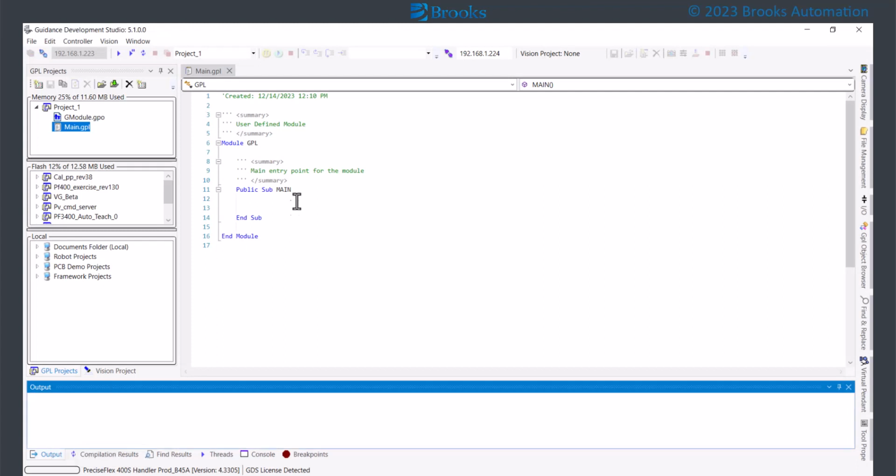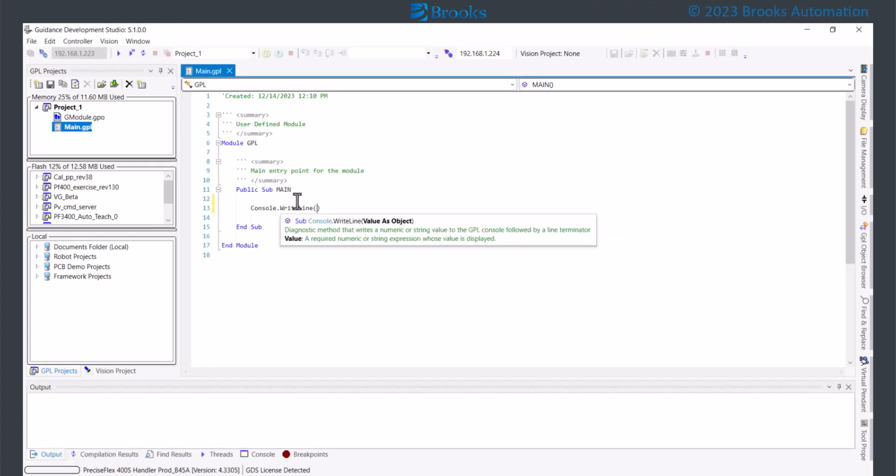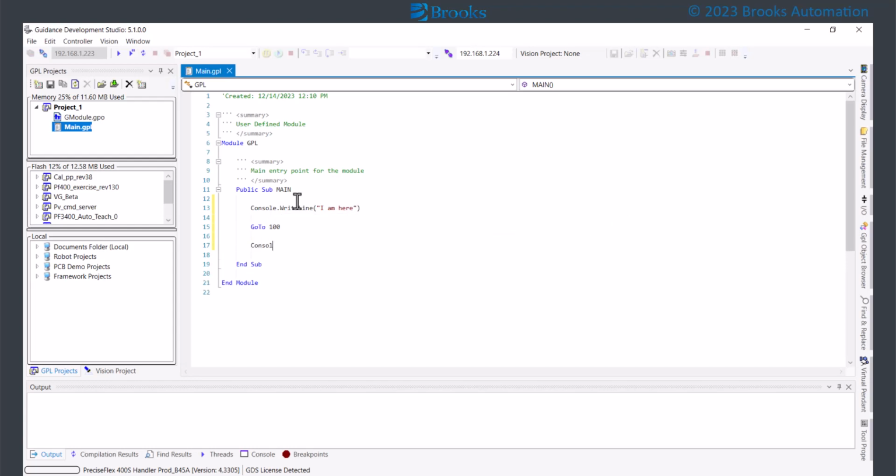The last control structure is the Goto statement. It is not recommended that this be used, but it is available. This instruction executes an unconditional branch and continues execution at a specified labeled statement. A label must either conform to the conventions for a variable name or an integer literal like 100. To label an instruction, the label is placed first on the line followed by a colon followed by any standard instruction. In general, Goto instructions can make programs more difficult to understand. So, whenever possible, other control structures should be used in place of Goto.